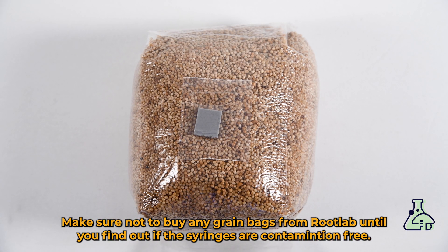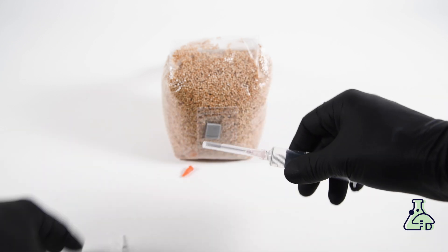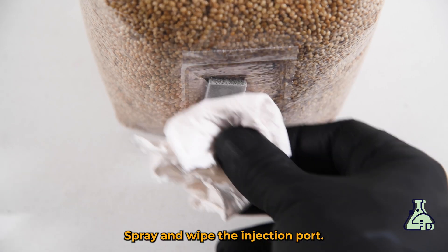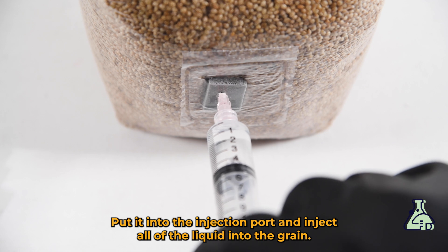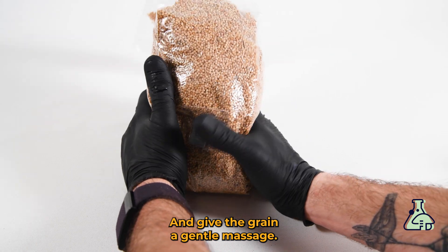When we find they're all clear for contamination we can grab one and inoculate some grain. Make sure not to buy any grain bags until you find out if the syringes are contamination free. Half undo the cap, open the needle, take the cap off, and put the needle on as quickly as you can. Give it a shake so that all the spores are distributed evenly in the liquid. Spray and wipe the injection port, then put the needle into the injection port and inject all of the liquid into the grain. Put the cap back on and give the grain a gentle massage.